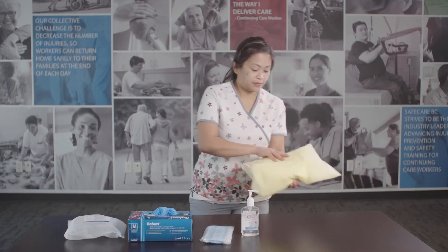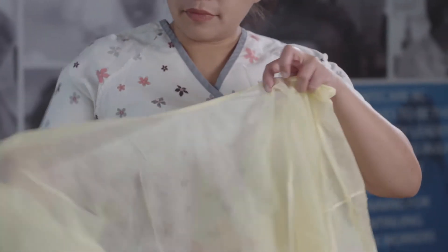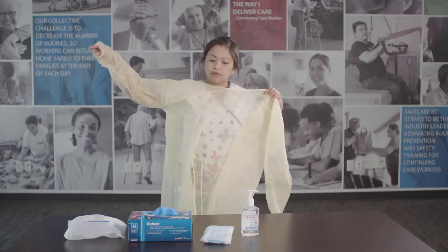Choose an appropriately fitted isolation gown and put it on. Fasten all of the ties or closures.